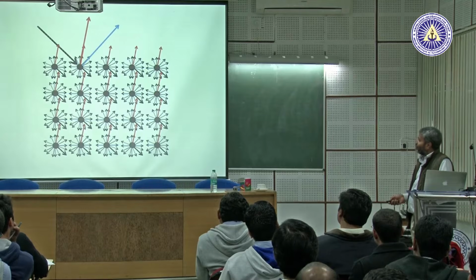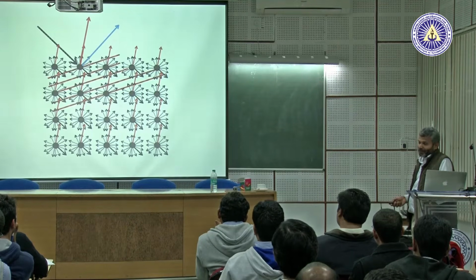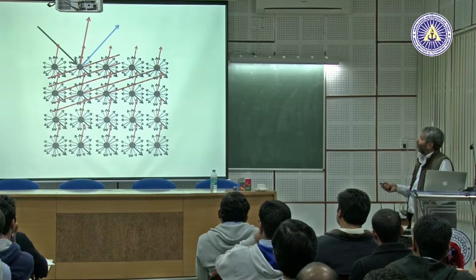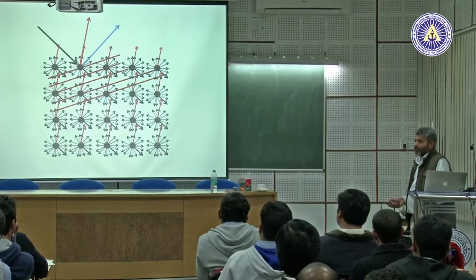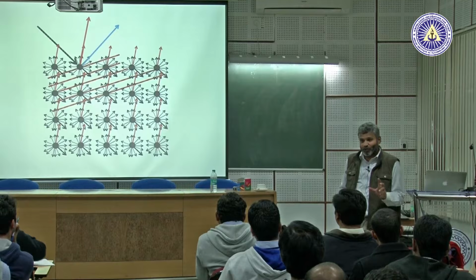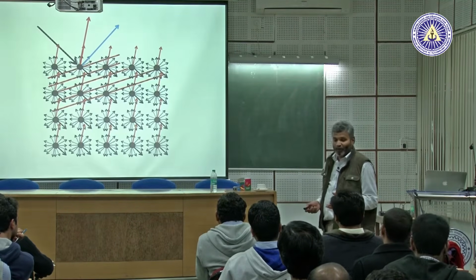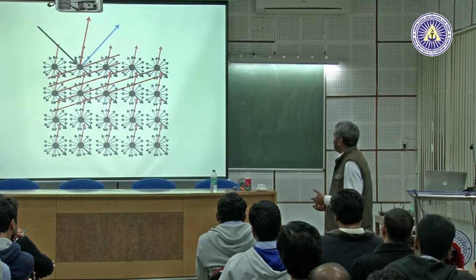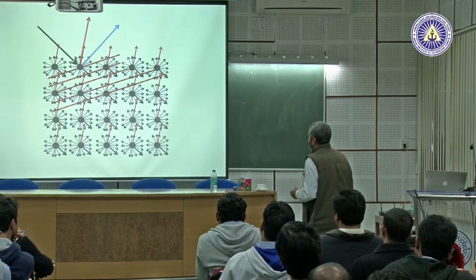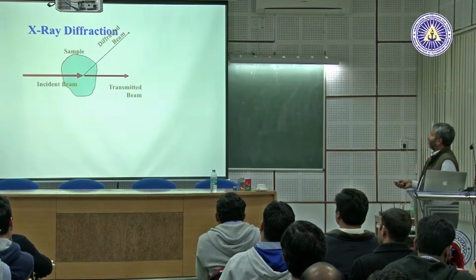Switch off the blue plane, and consider new red planes from which it will appear to be reflected. So, this was Bragg's genius. This was the imaginative jump which did not come from a logical deduction, but from looking at the problem and coming up with these nice mirror planes.